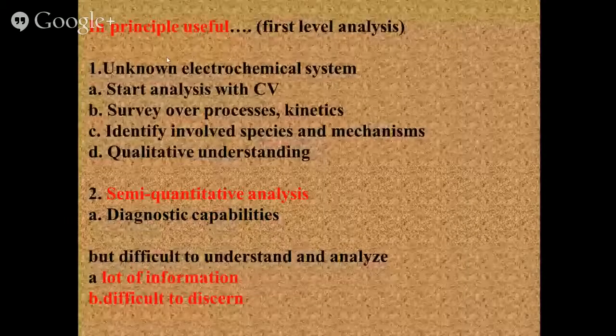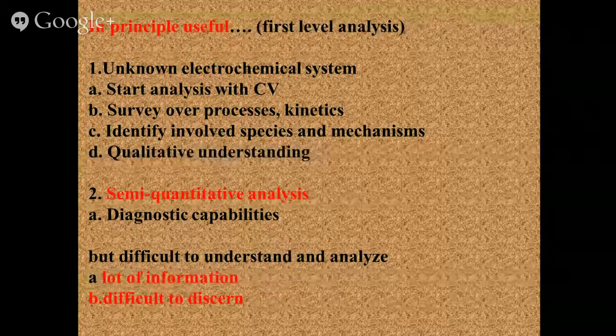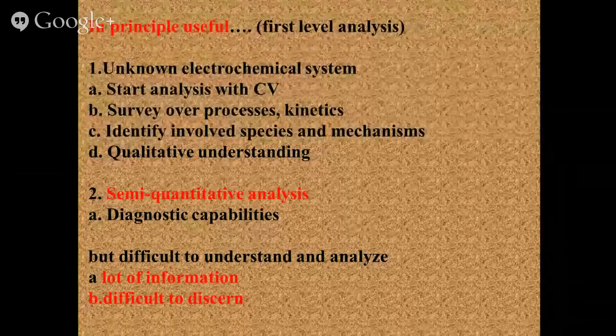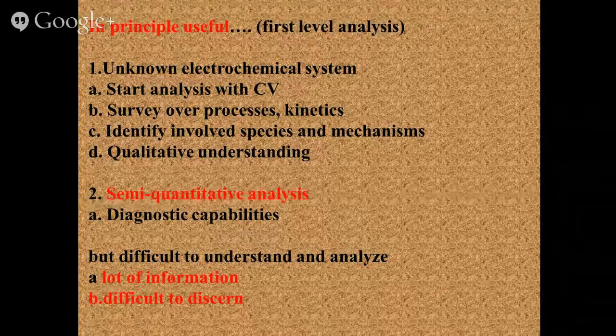So in principle, at the first level of analysis, I can take any electrochemically active substance and identify what it is, what its concentration is, how much of it is present, and all those things. Start analysis with this CV. If I have an unknown system, the best thing would be to run a CV, find the reduction potential, and match it with the reduction potential of the known system. Now, if in addition to the electrochemical reduction other processes are taking place, then we can use the cyclic voltammogram peaks and analyze them. So we can even get an idea about the intermediate species. For example, nitrobenzene gives hydroxylamine, and then goes to amine. All these things will be manifested there, so all these intermediate species also will be there. So it gives me not only qualitative information about the process that is taking place, it can also give me a certain amount of quantitative information.